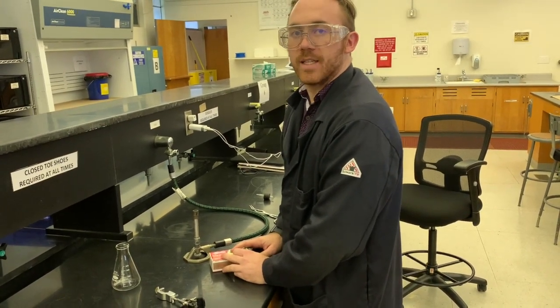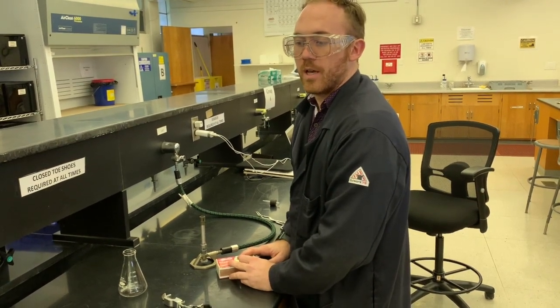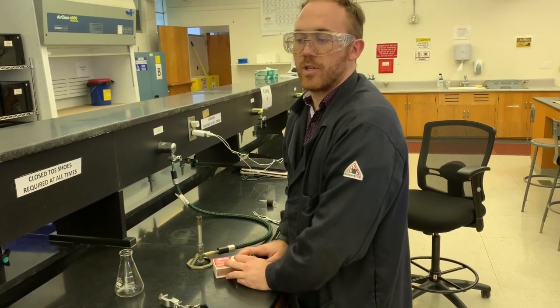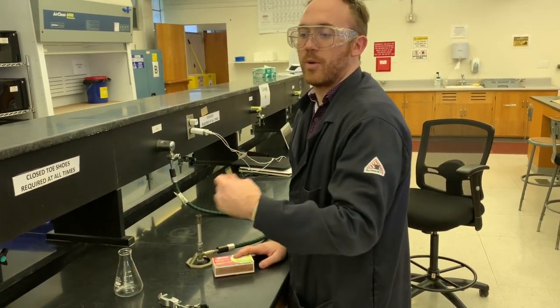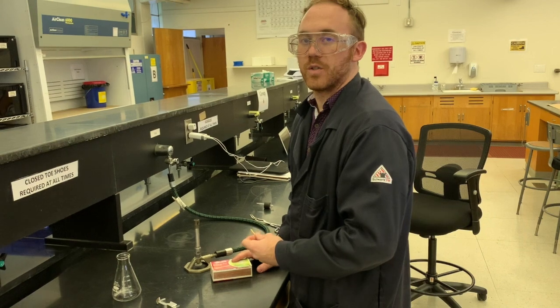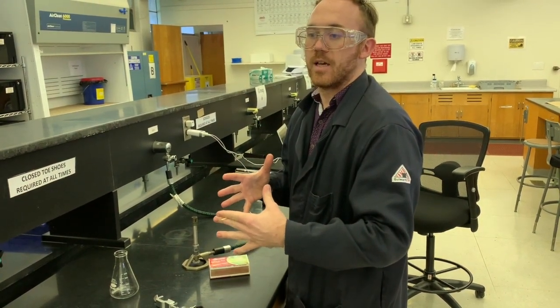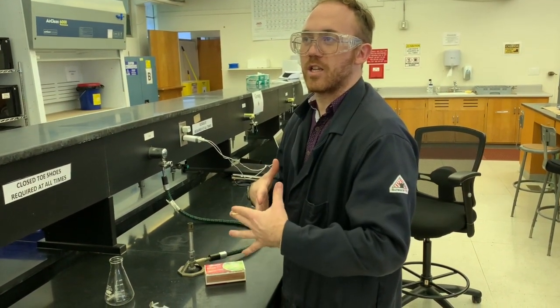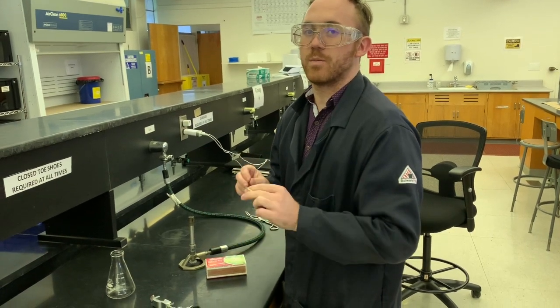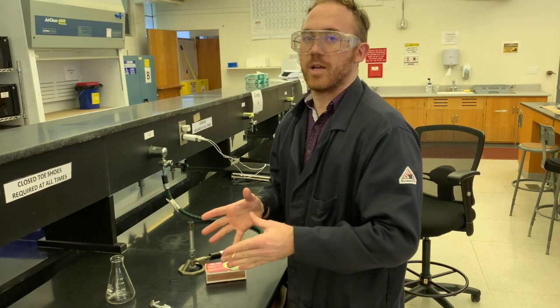The thing about gas is that gas can change volume depending on what the temperature is, but something that does not change volume very much is water. So what we're using today is we're drawing a little bit of water into a flask in order to fill in that empty space created by the void of the gas. It's going to be held at a relatively constant pressure. So the thing that's going to change more than anything else is going to be specifically the volume, drawing in that water and giving us a measurement.